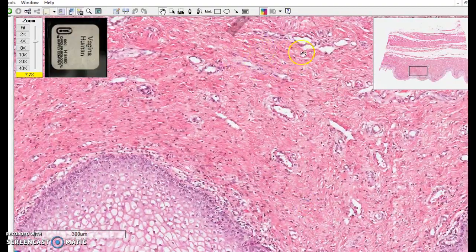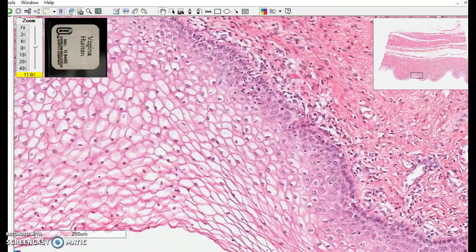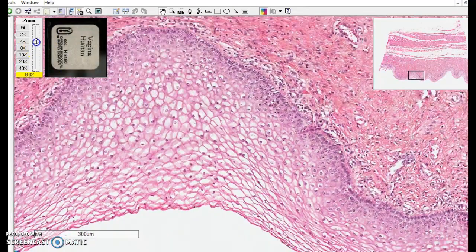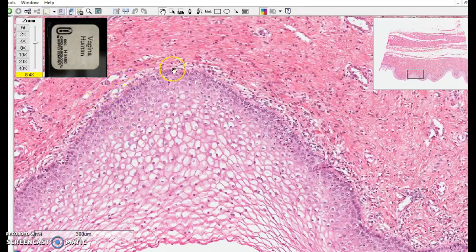This is dense irregular connective tissue, various connective tissues, but what we're interested in is these layers at the surface. So again, here's a basement membrane, a very sharp distinction between this tissue, this tissue, and that tissue.